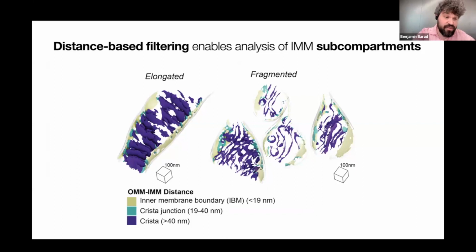The cristae junctions are highly regulatorily important because when they open up, that triggers the flooding out of cytochrome C, which is the first concerted step in the apoptosis machinery. So once the cytochrome C is out, this cell is getting ready to blow up.